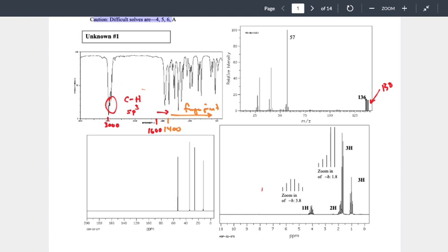If yes, we could then say it's a 1-to-1 ratio, and because it's 1-to-1, I know bromine is present. How do you know it's 1-to-1? Look at the graph. We look at our M+, we said it was 136, and our M+2, 138. What's the height of those 2 signals? They're about 1-to-1. That's what we're referencing, that intensity. As far as the conclusion goes, yes, I've got bromine. I could also say no chlorine, because I don't see that 3-to-1 for chlorine.